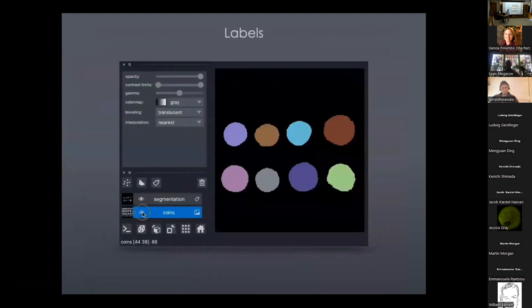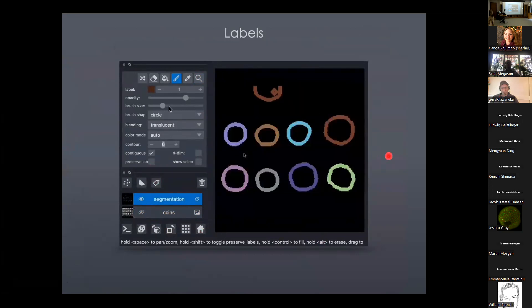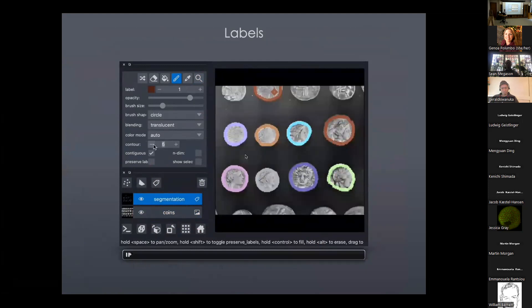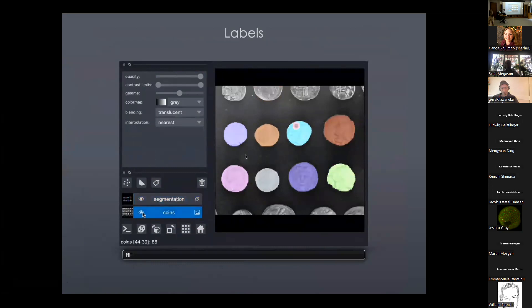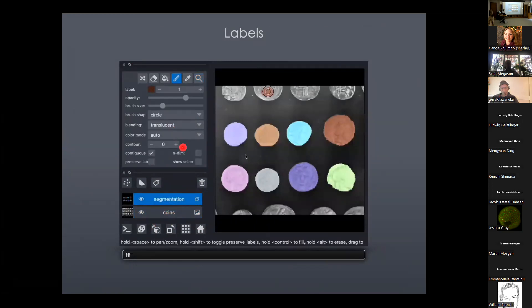Labels are our name for masks, integer arrays, Boolean arrays. The colored layer on top of the image is essentially a labels layer where the integer ID corresponds to the identity of some object in the image. There are all the standard painting tools you would imagine — when we click on the labels layer, we get a paintbrush and can edit, delete, and update.